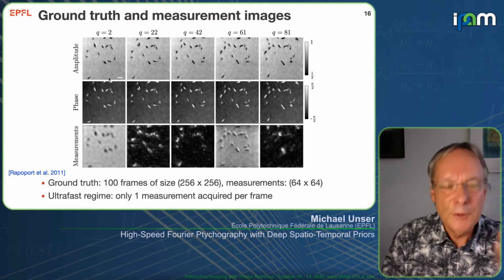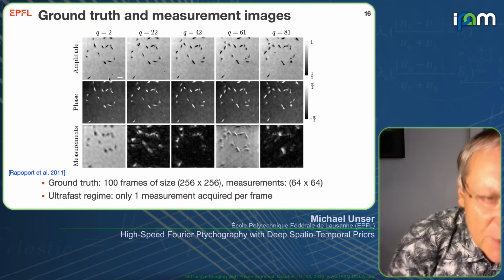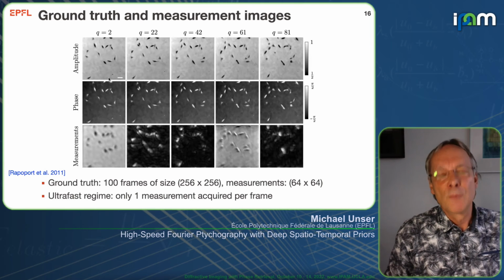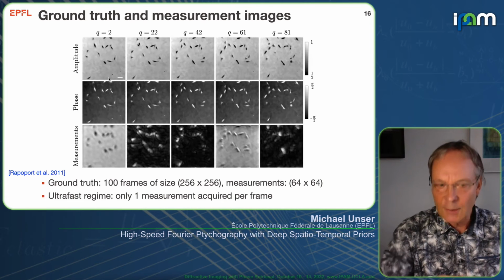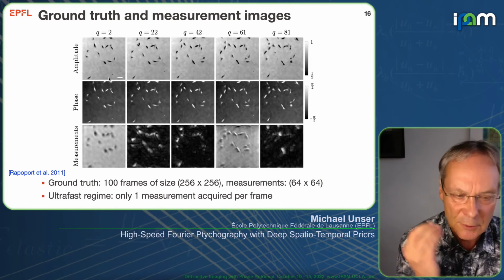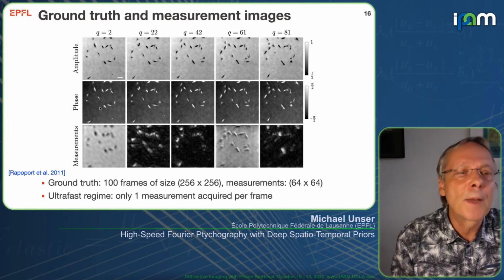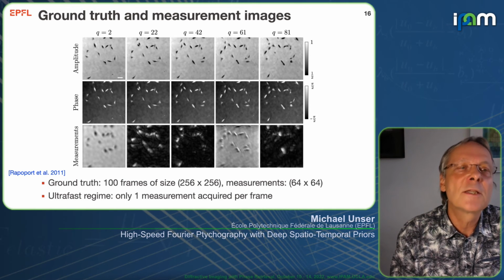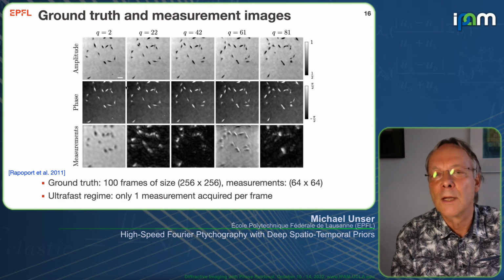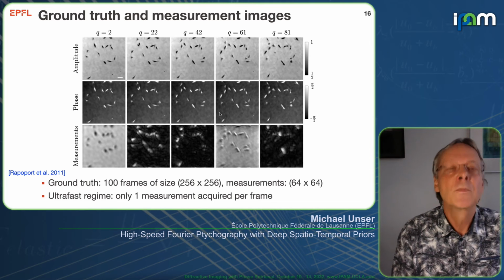What we did with those images, which are a sequence of dynamic images, is we simulated actually. We assumed the images are relatively flat, so thin, and so we use those images as the refractive index, and then we generated, using a beam propagation method, some realistic phase and amplitude images that would correspond to this dynamic sequence. And so they are shown here.